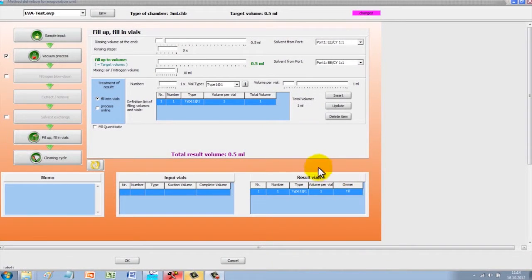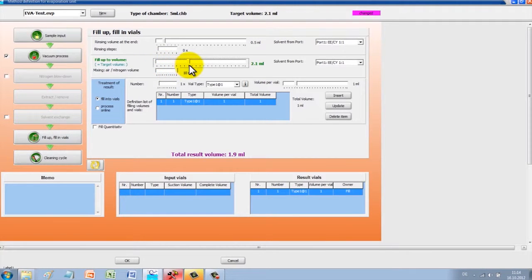The software allows you to select an end volume of between 0.5 and 5 milliliters. This will be saved in the method, and may differ from sample to sample, even within a sample sequence.